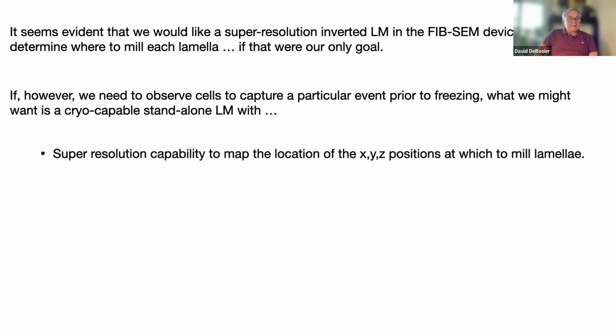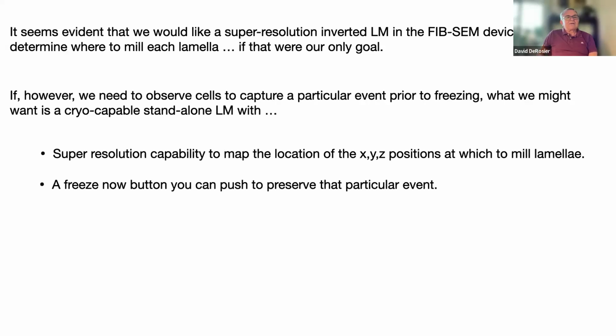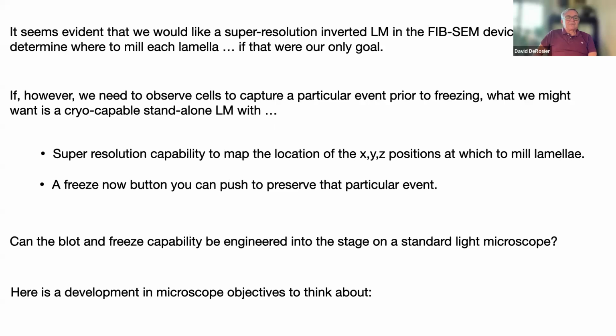And the second thing, and I've heard this at a recent meeting I was at, people would like a freeze-now button, so that when you see a particular event, you push a button and it freezes the cell where you are. Now, this doesn't exist. The question is, can you somehow get a blot and freeze capability engineered into a stage on a standard light microscope? Seems kind of crowded.